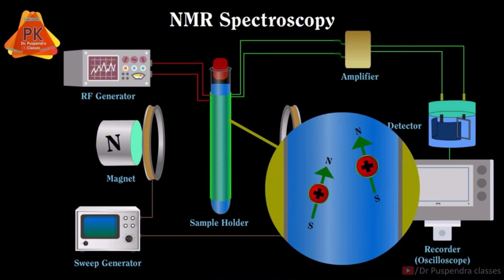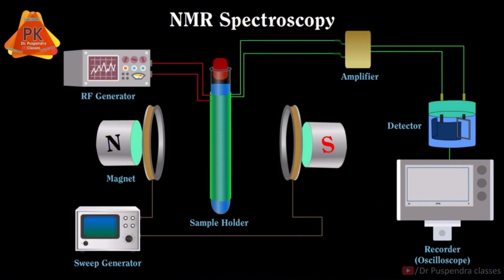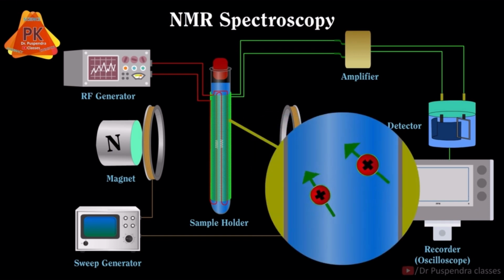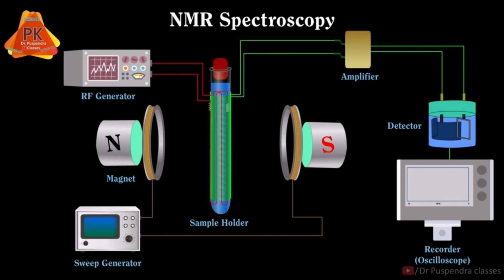First is the radio frequency transmitter. It produces radio frequency pulses at the predetermined power, frequency, form, and timing. The frequency generator and waveform generator create the necessary shape. It also features a power amplifier that steps up or regulates the radio frequency power to the predetermined value, in addition to a gate that regulates the radio frequency transmission at a specific time.